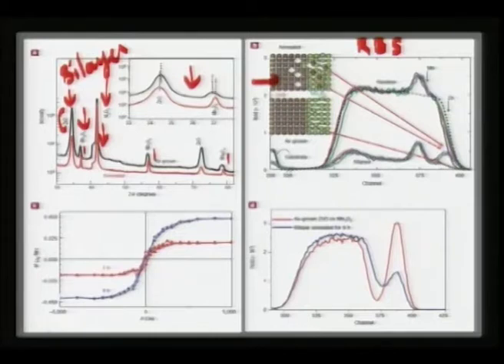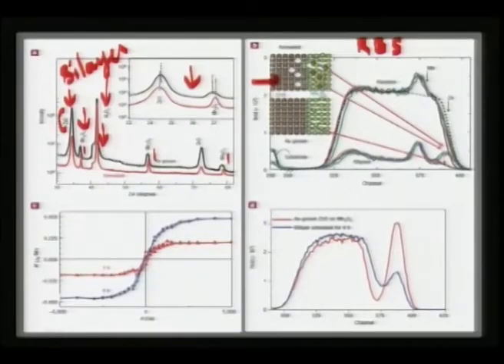is showing a substantial decrease in zinc because you have Mn3O4 on the top. But as you anneal the sample, you can see that suddenly a camelback is coming, and that camelback is actually due to Mn3O4.